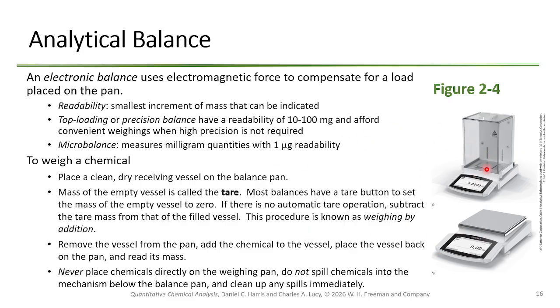You tare off the mass of that vessel. It needs to be in the middle of the pan. Can it be hot or cold? What happens if I heat the pan? What happens to the air under something I heat? Pushes up against it, doesn't it? Okay. If I cool the pan, what happens? Pulls it down. Okay. So you have to be careful. It needs to be essentially room temperature, and you need to be really careful about it.